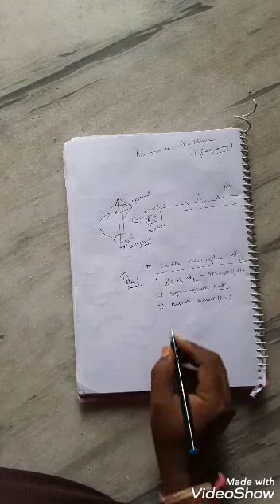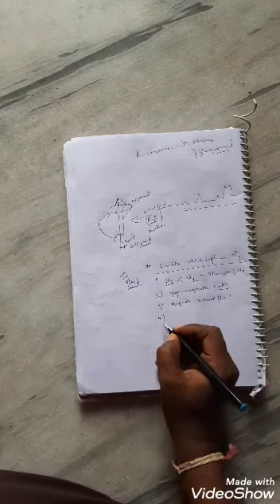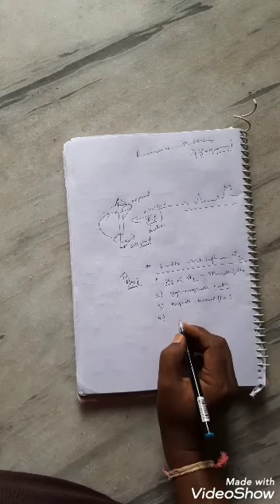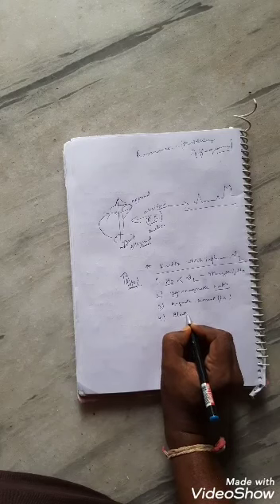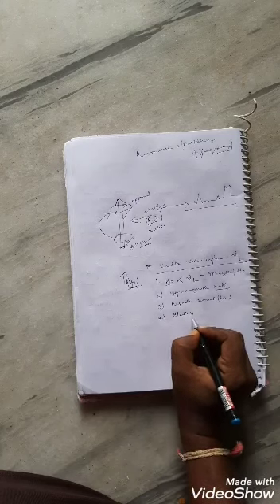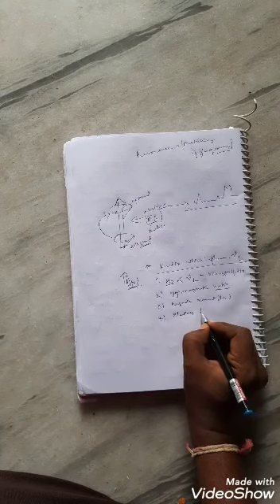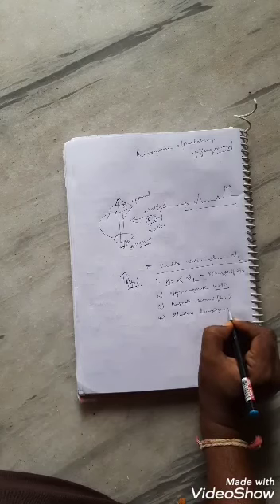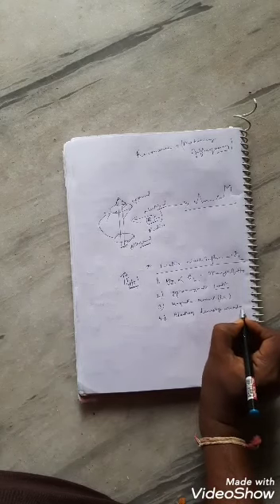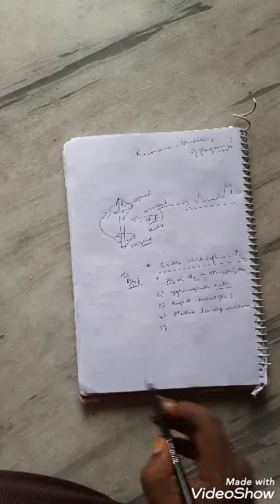And there are certain other factors which will also influence the precessional frequency. The nucleus is influenced by the surrounding electrons, so the electron density around the nucleus matters.